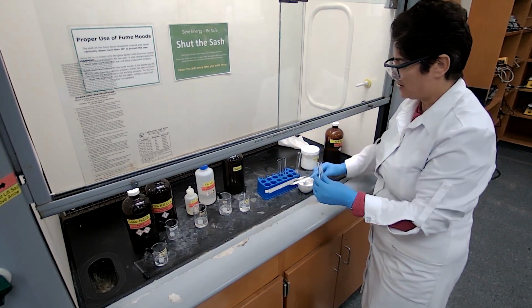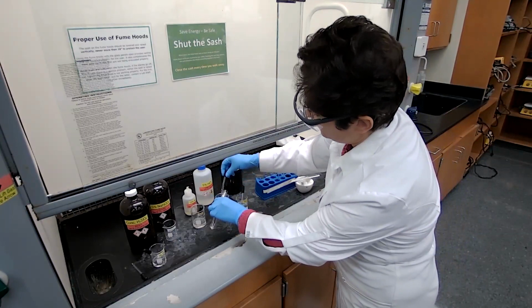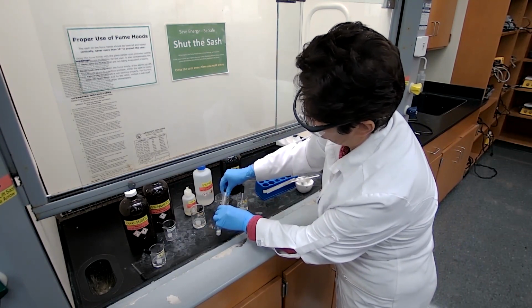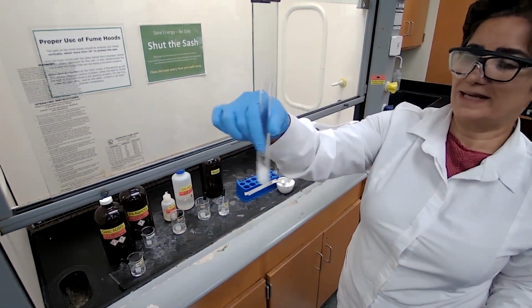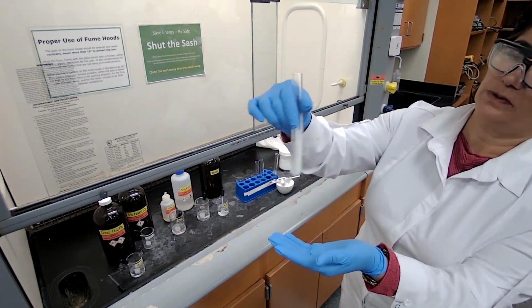Tip of a spatula, about 0.1 gram of the sample, and 3 full droppers of the HCl. Mix it well for 10 seconds and check for solubility.